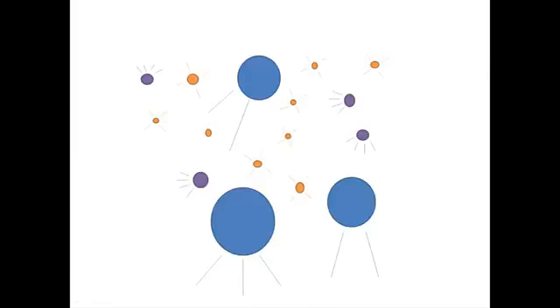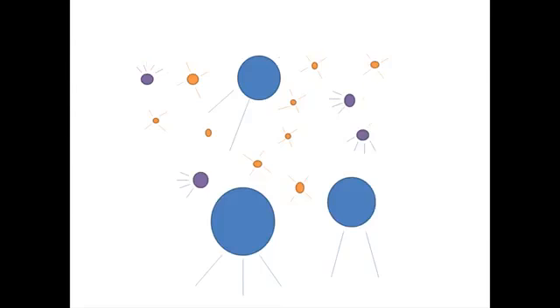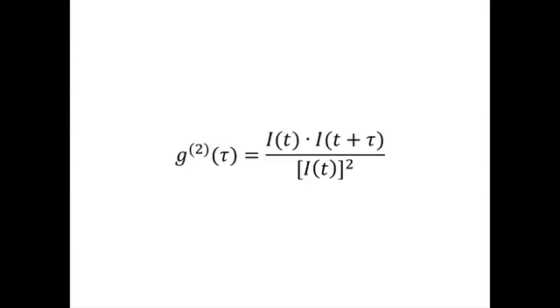Particles experience Brownian motion when suspended in liquids. Random collisions with solvent molecules cause particles to diffuse throughout the liquid. Laser light is directed onto the particles and the light scatters. The observed intensity of the scattered light is a result of the interference of light scattered by each element, thus it will depend on the relative positions of the elements. After measuring the fluctuations in light intensity, an autocorrelation function analyzes the data.